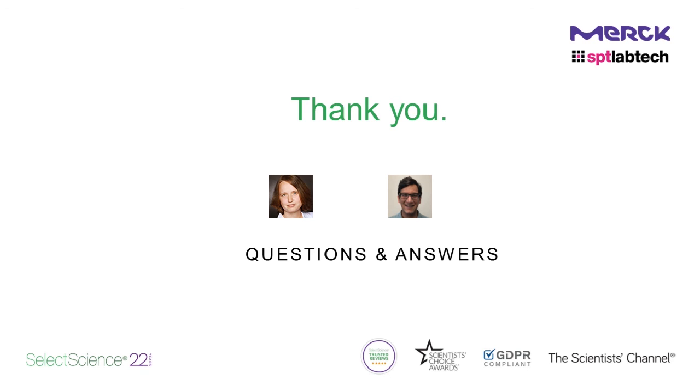Fantastic, thank you. So the next question we've got is, have you used the instrument to run cell-based assays? Yes, indeed, we did. And since the dragonfly is working fast, you sometimes don't even have to be cautious of the cells settling in the syringes. So it worked just fine. Perfect. Okay, so the next question we've got is, are there dragonfly tips available that have low protein binding properties?